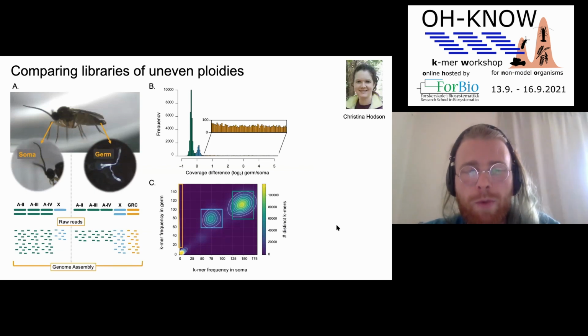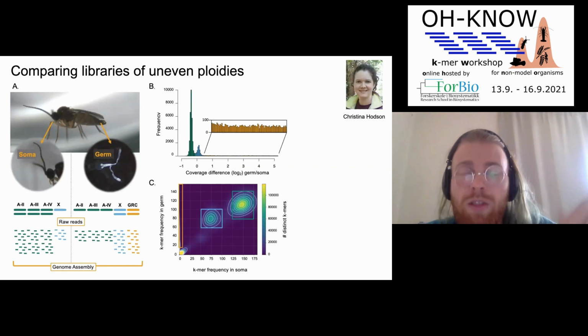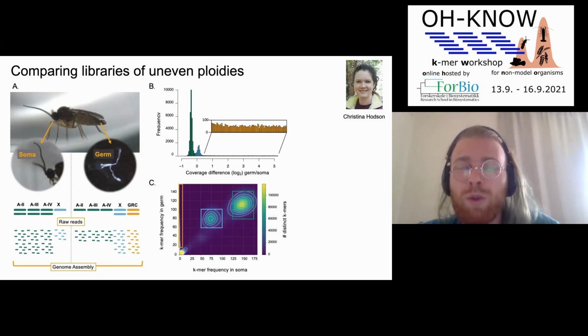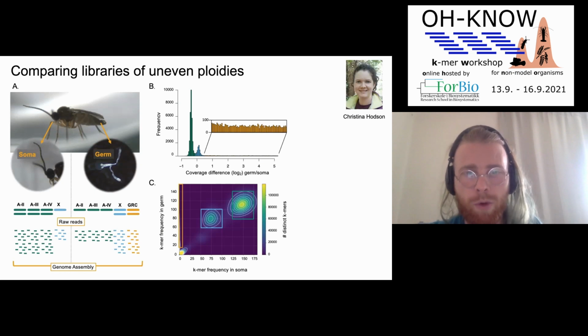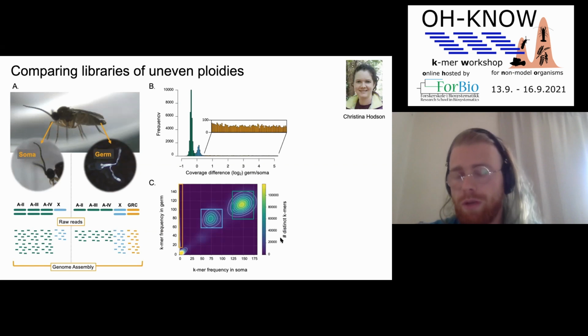So the main reason why I wanted to re-explain this and show you the example is just to give you the idea again of how to detect mixed tissues and how to deal with them. The fact that it's shifted actually doesn't have to be a big problem if you know that it might be a mixture, and if you know that the two karyotypes can possibly be there. You can also use it for discovery, but then it's a tiny bit more complicated. And again, I don't want to advise you against using the mapping approaches, but I do think the biggest power is in using the two approaches in combination.